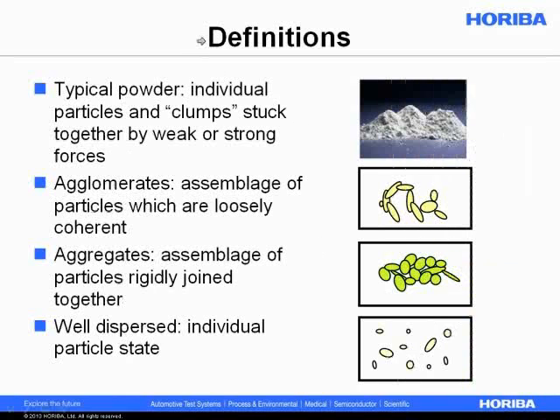All right, so as we talk about these powders that we're going to disperse in liquid, powders generally exist in some kind of clumped aggregated state. Just a picture here of powders, and generally you're not always looking at individual particles. They're clumps stuck together, either by weak or strong forces.